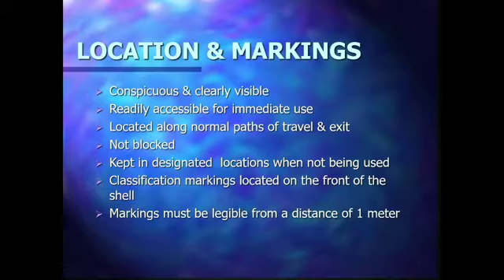And please do not mix them with the regular fire extinguishers, because during an emergency you won't have time to check whether they are ready or not. Please ensure that the maintenance or used fire extinguishers are placed in a very, very dedicated place. Do not mix them with the readily serviceable fire extinguishers.